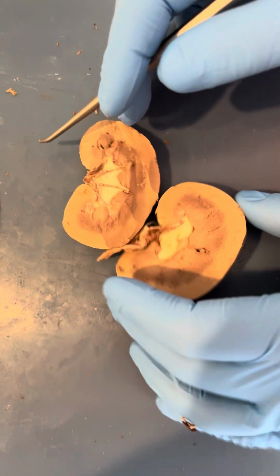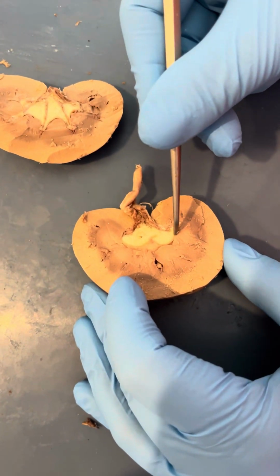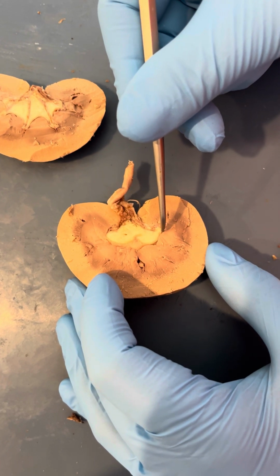Then transitioning to the inner portion of the kidney is the renal medulla, which is a thin layer just around the minor calyx, and it contains the loop of Henle, collecting ducts and blood vessels, which are responsible for urine concentration and facilitating electrolyte balance.